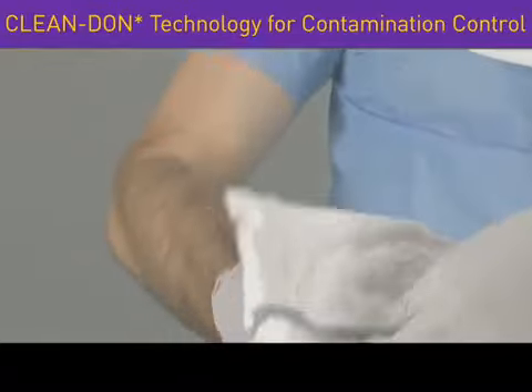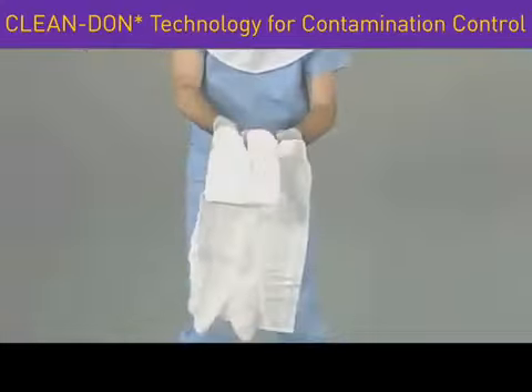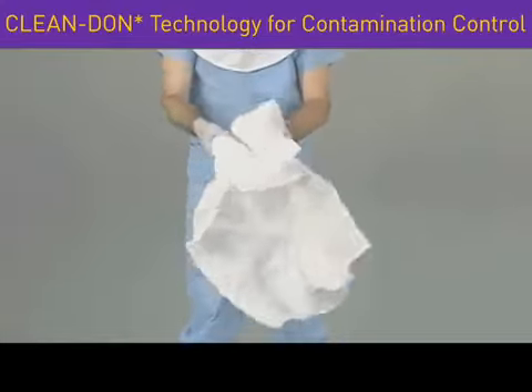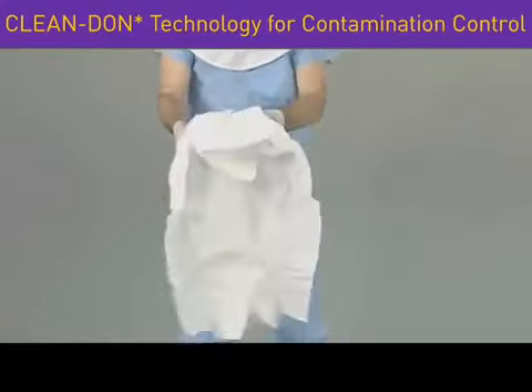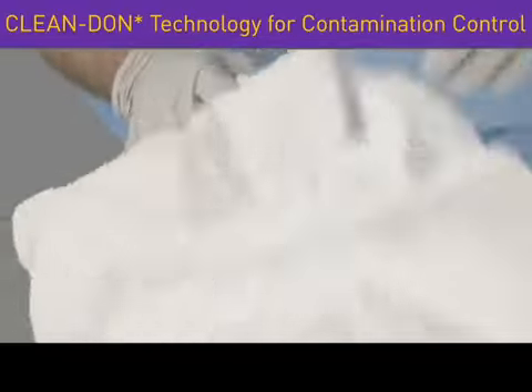Gently unfold the coverall utilizing the blue indicator line. You'll notice the arms and legs are pre-drawn and snapped in place. These snaps allow the gathered-up arms and legs to expand during donning.